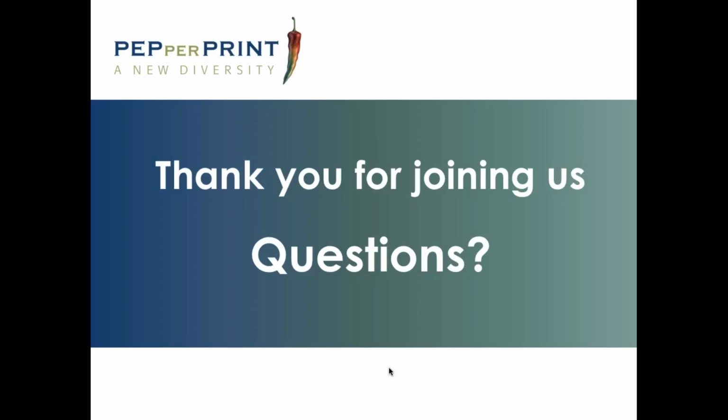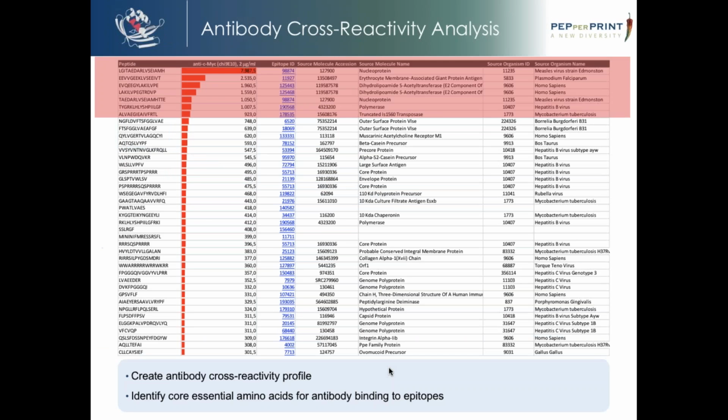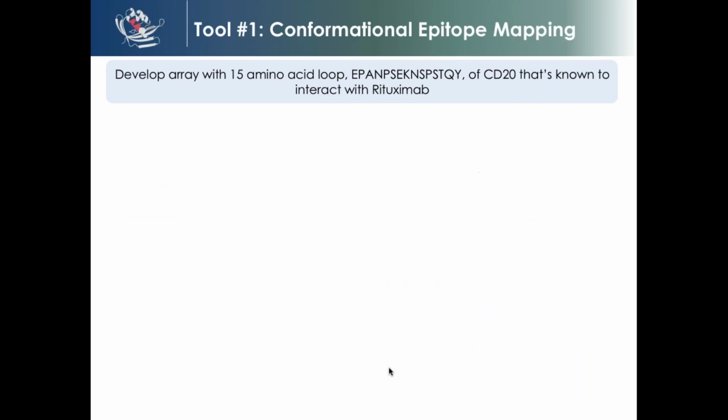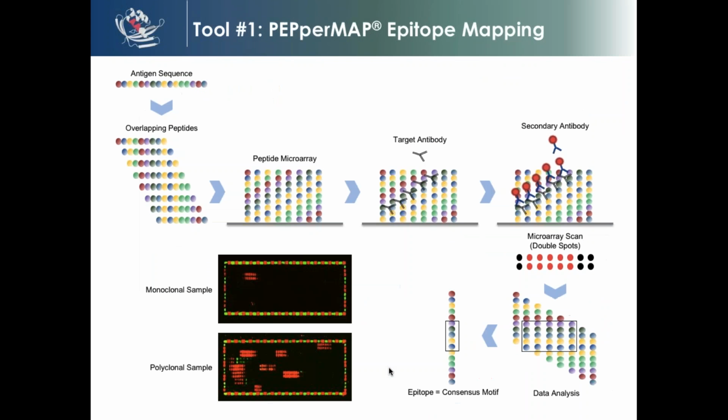Someone from the audience asks, could you explain again the red and green ribbon as controls? What are they? Maybe anybody of the panelists can briefly comment on this? Yeah, so what you see there are our control peptides. We print HA and flag control peptides around each peptide library just to control for the staining. So in green there you see HA and in red the flag, which are then stained with specific antibodies that are fluorescently labeled.